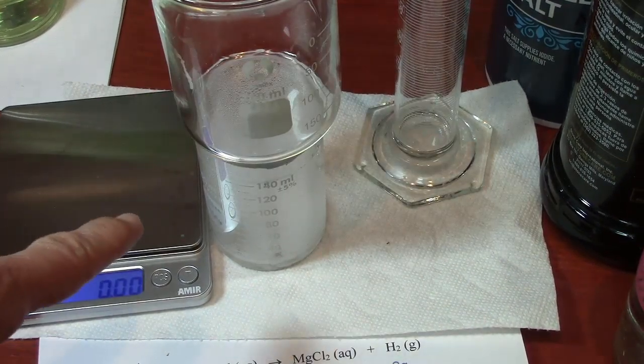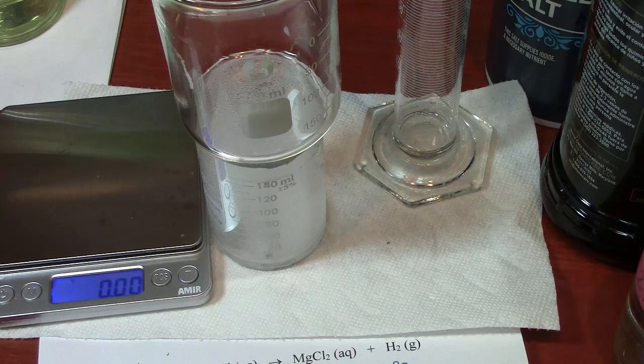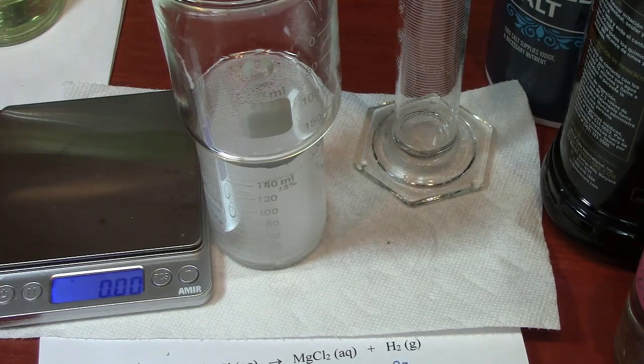Here I put a makeshift lid on the reaction beaker. I'm not in the lab, I'm in my office. I want to keep the fumes in the beaker as much as possible. So I'll come back in a little while to see what it looks like at the end of the reaction.